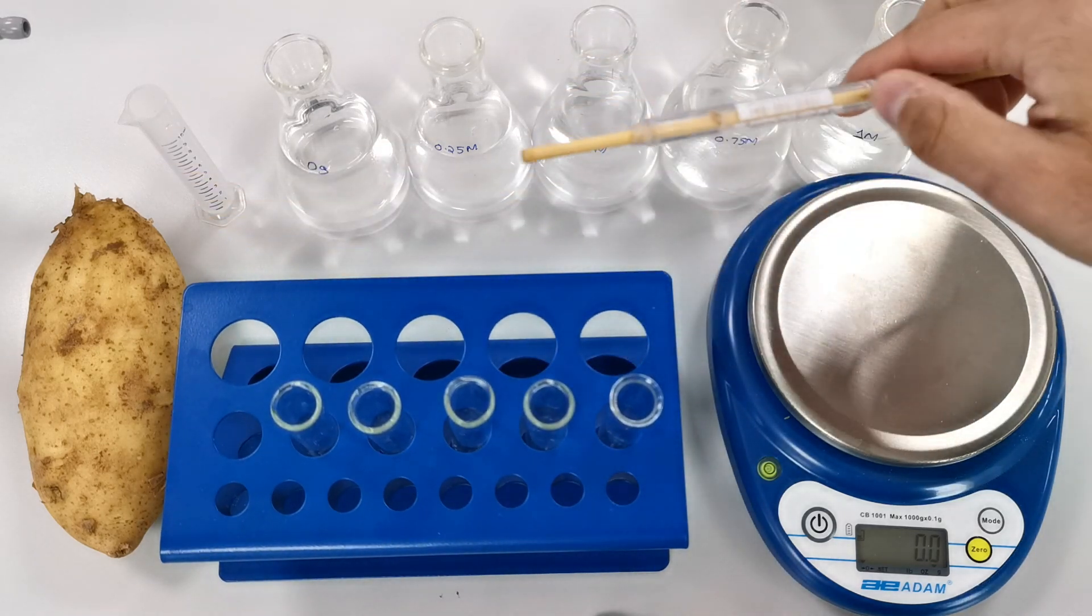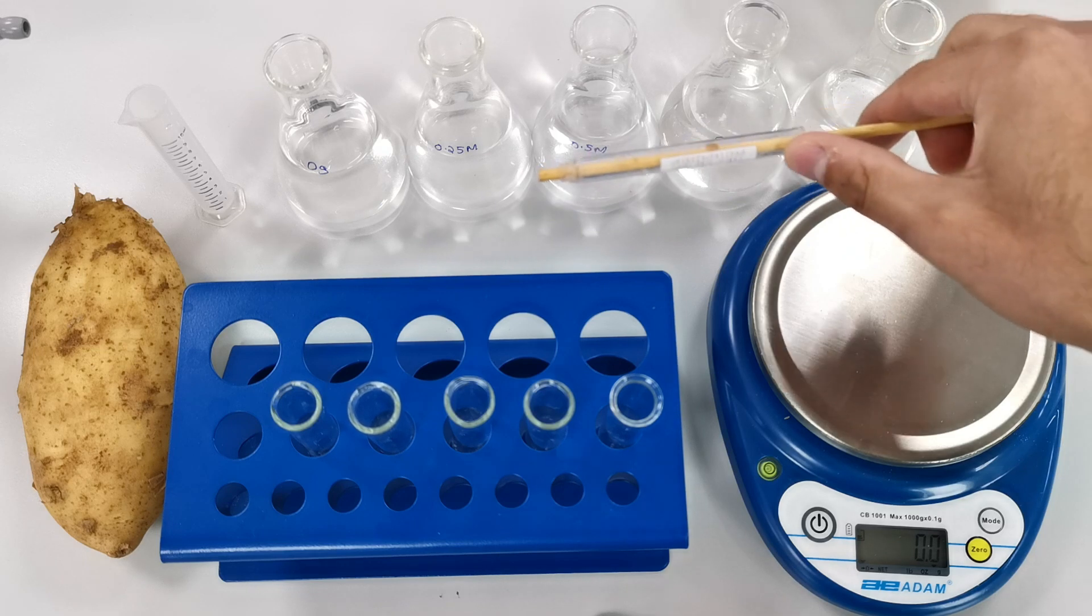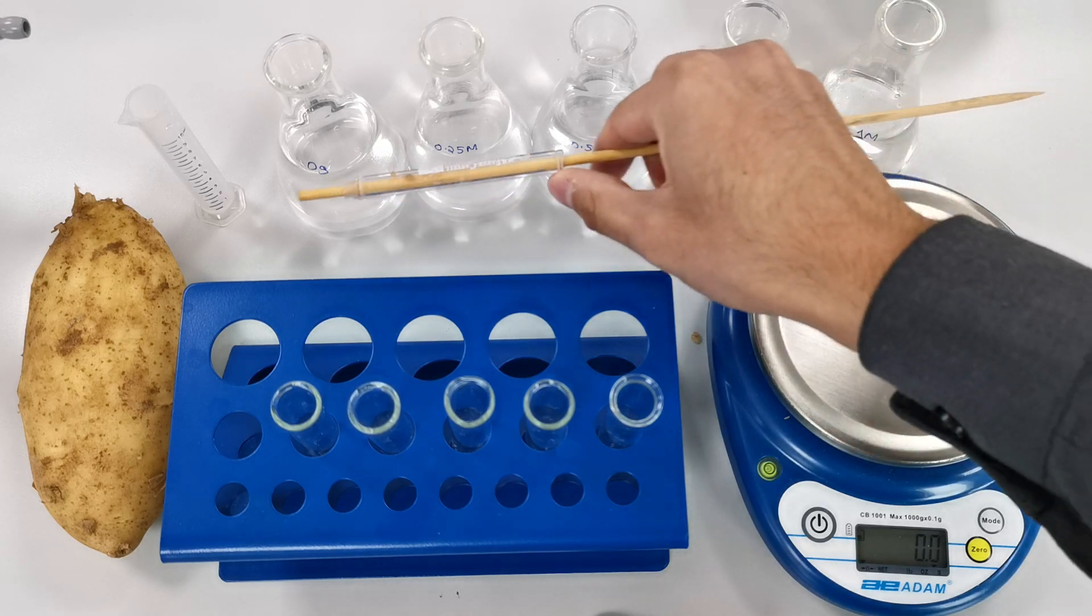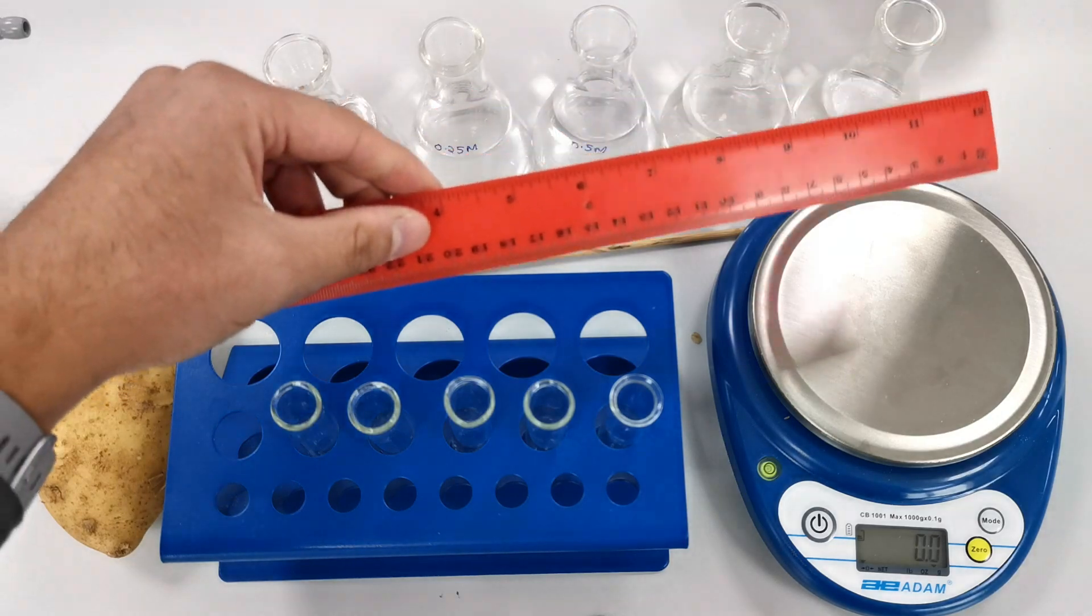In this case I've used a pen and a stick to push through the potato cylinders and you're going to need a ruler.